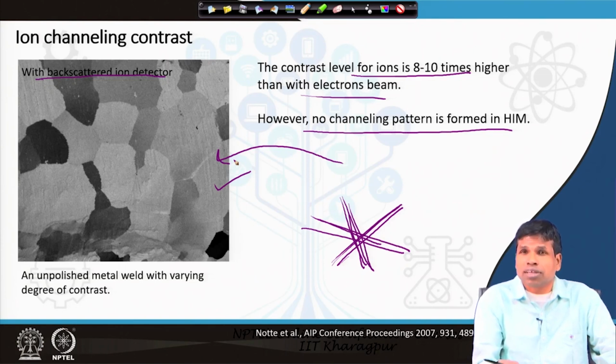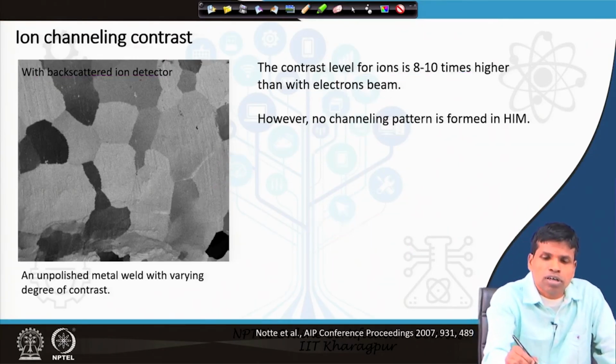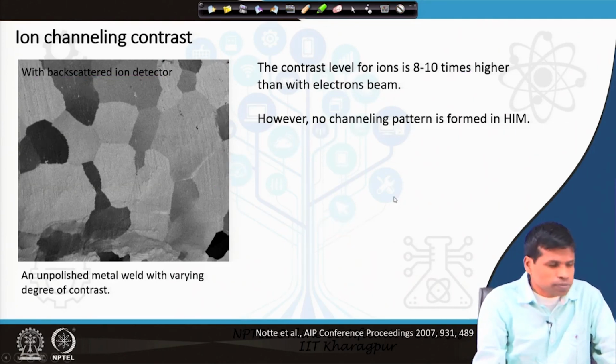Therefore a bulk, thicker sample is one of the requirements for the scanning electron microscope, but not here. Here we would prefer a thin film or information from the surface. If we want information from the bulk, this is not suitable, and then one should go for the scanning electron microscope.